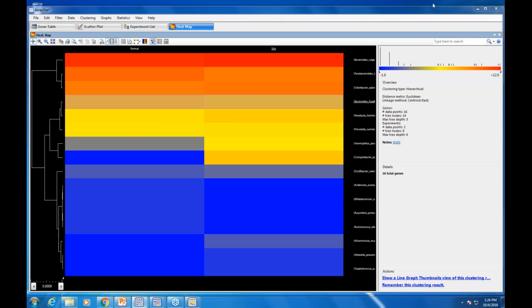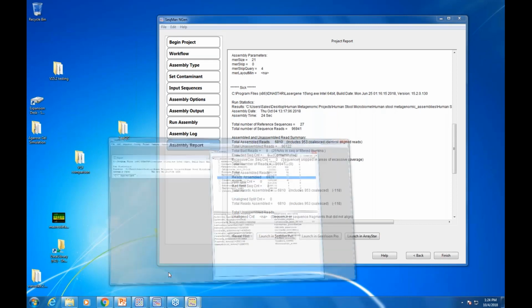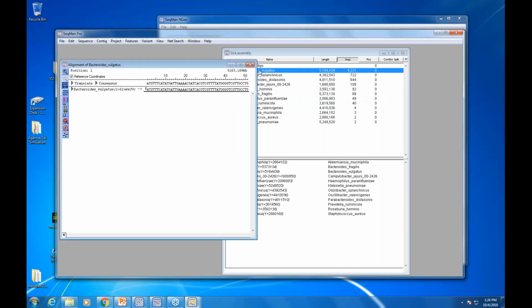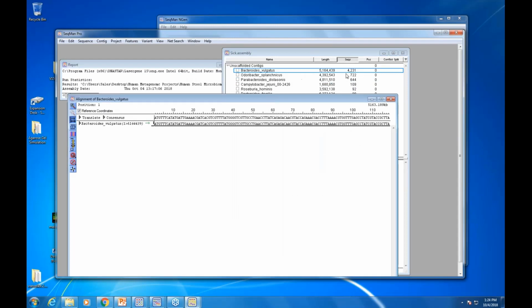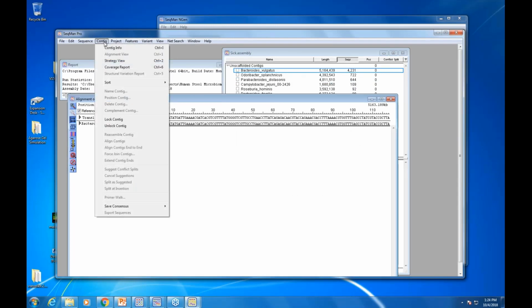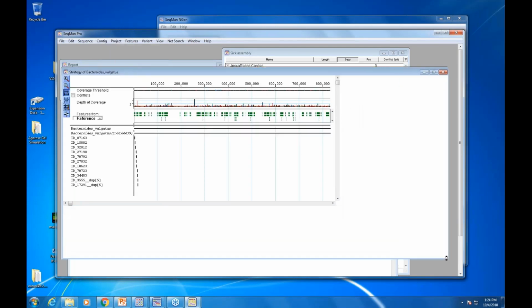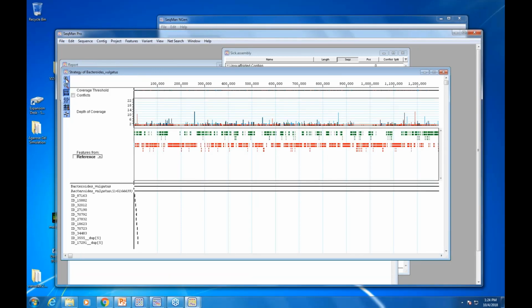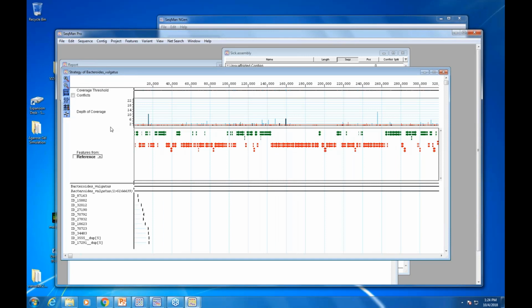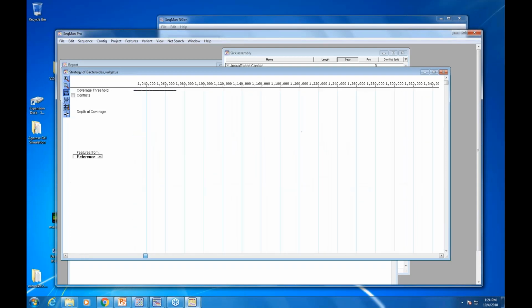And so we'll close this. I am going to go back to the alignment. I forgot to show you one thing, and that was we can look at this aligned data. And even though it's really sparse, we only have 4,000 reads here, I'm going to go to the strategy view. And the strategy view is a map that's going to show me coverage. And again, I call it kind of a sanity check.